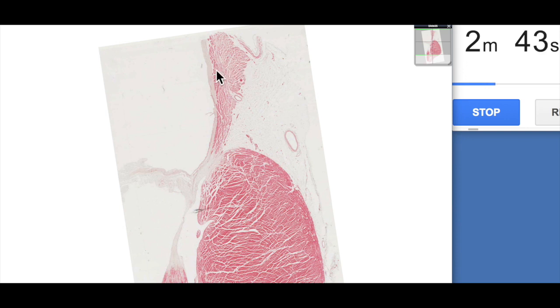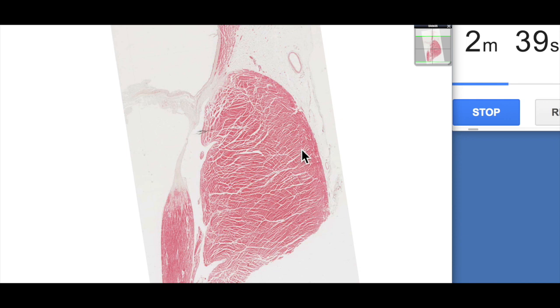So the atrium has a much smaller size to its wall and then the ventricle obviously very thick muscular wall particularly here.